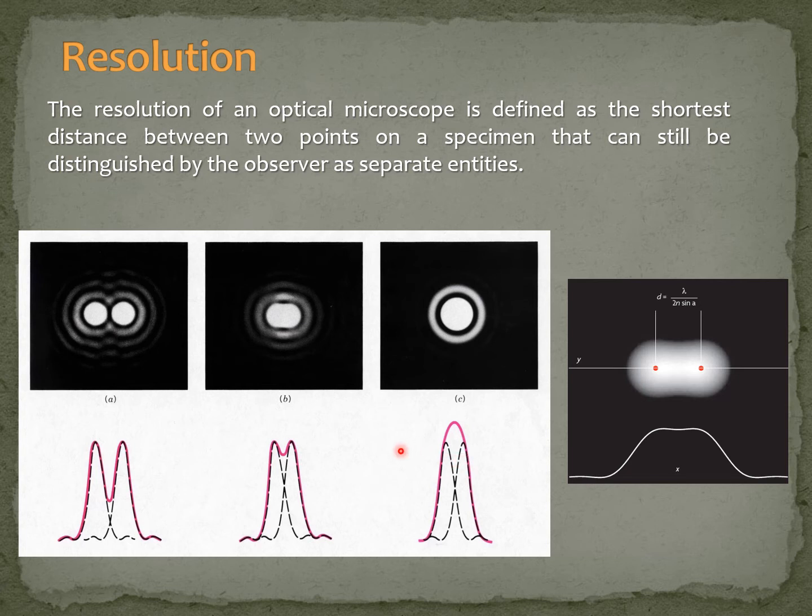So Abbe's law basically established a limit to what it's possible for me to observe, because we know the wavelength of the minimum light ray that I can see with my own eyes. So below that I will not be capable of resolving two objects under a light microscope.